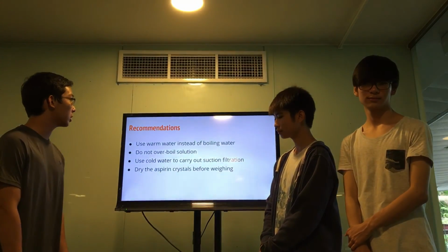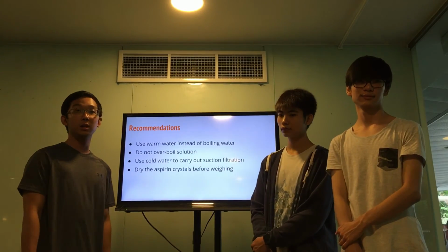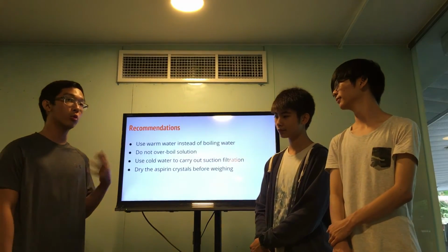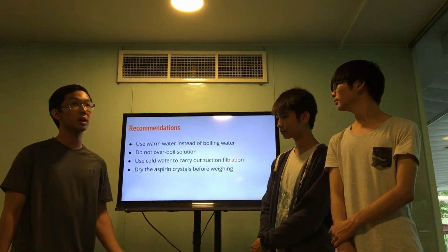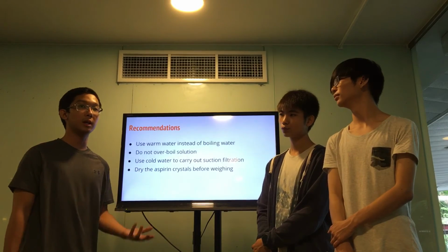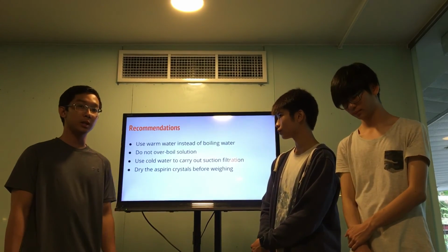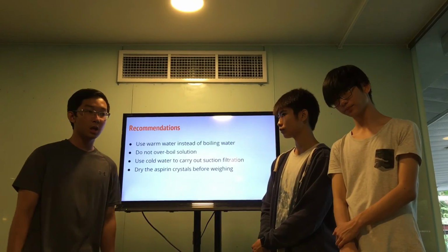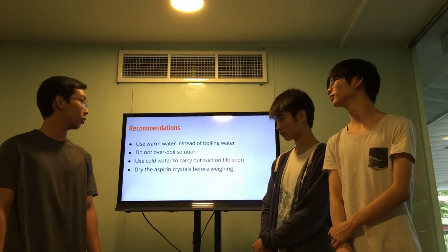Okay. Warm water could have been used instead of boiling water, as boiling water needs more time to cool down. So by using warm water, the experiment could be done faster. And do not overboil the solution, as overboiling may cause the yield of the aspirin to be low.